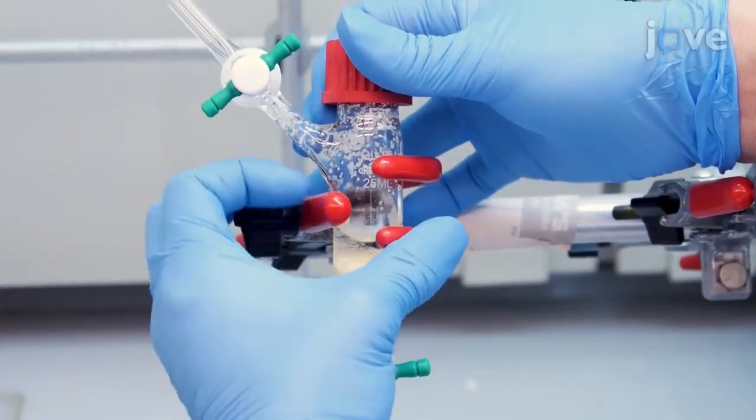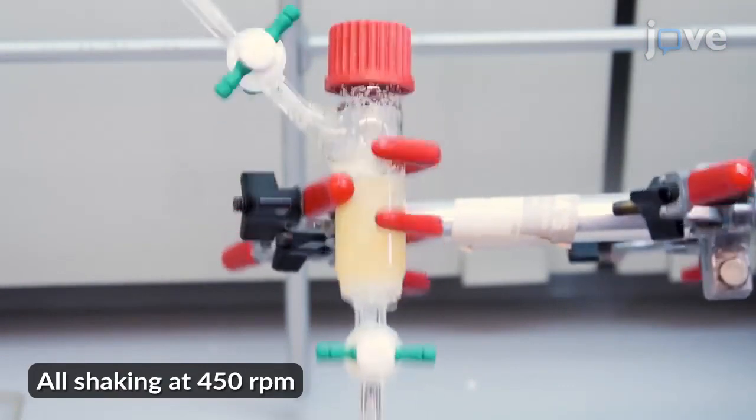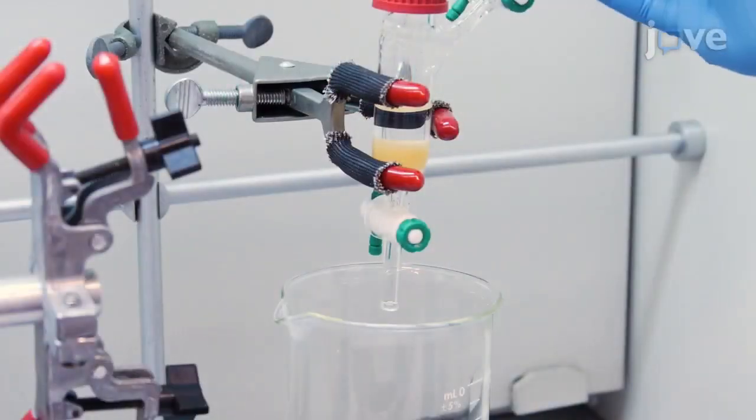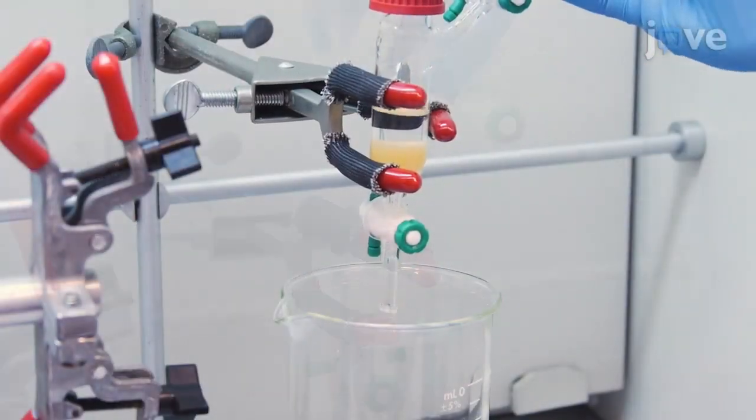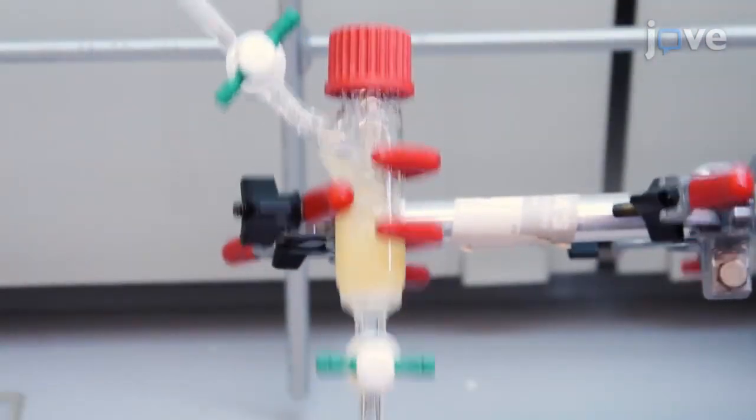Cap the vessel and agitate it for 24 hours on a shaker at room temperature to load the resin with furfurylamine. Then drain the furfurylamine-bearing resin and agitate it for about 3 minutes in 5 milliliters of DMF to wash it.